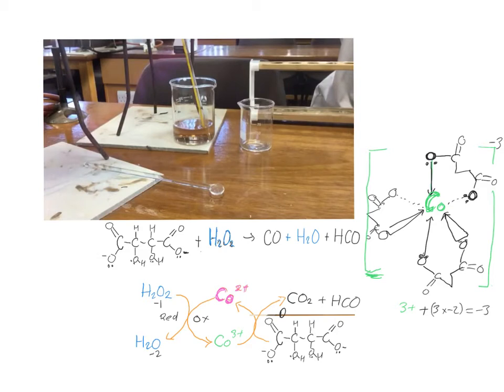Effervescence is now beginning to be observed as the butane dioate ions start to decompose to carbon dioxide.